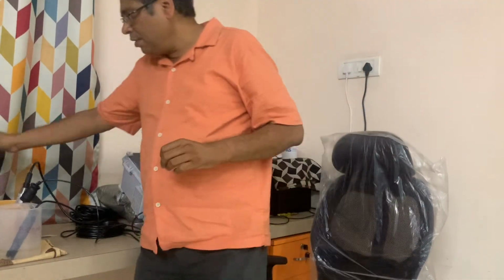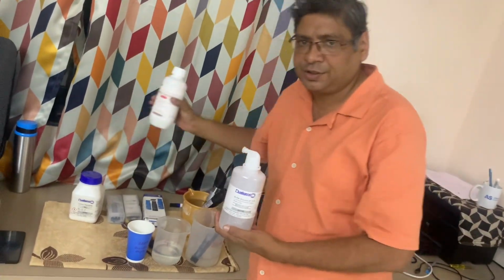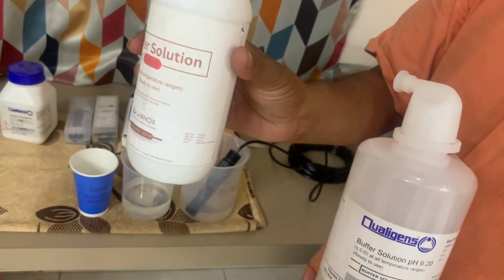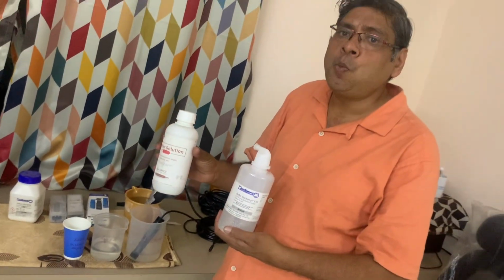Here, on your demand, again I am making this online and offline class for the calibration of pH and DO analyzer. For that, prior to this calibration we must have this kind of standard solutions. These are the standard solutions. Right now I have solutions of 4 pH and 9.2 pH. So we will do 2-point calibration.